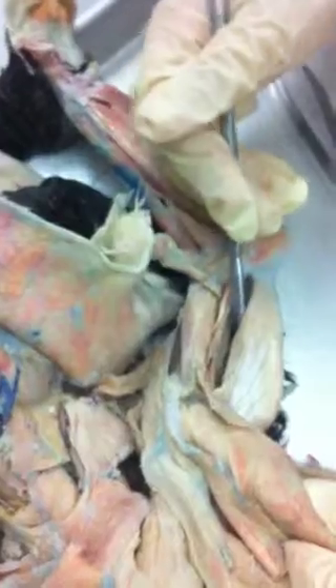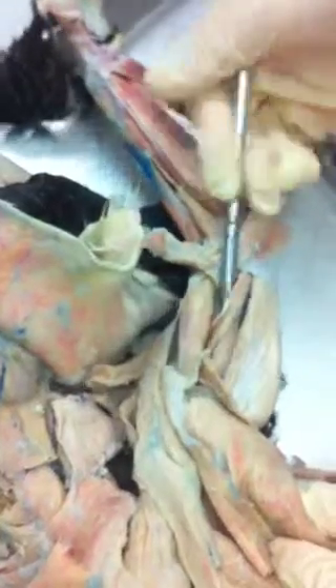And underneath all that, we have our biceps brachii right here. We have here the epitrochlearis, and if you reflect that, we have the long head of our triceps brachii and the medial head of our triceps brachii.